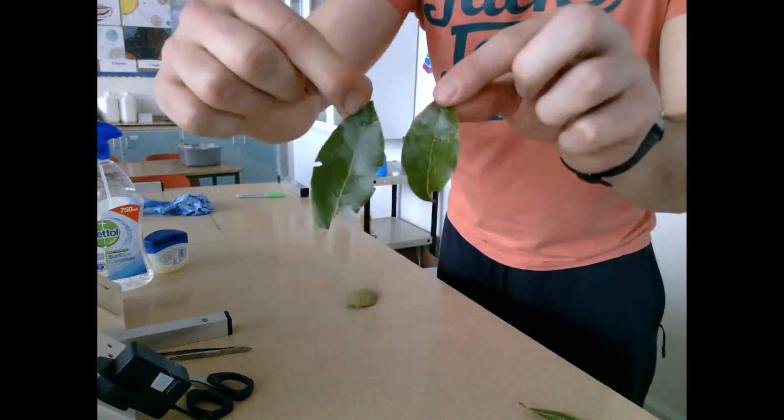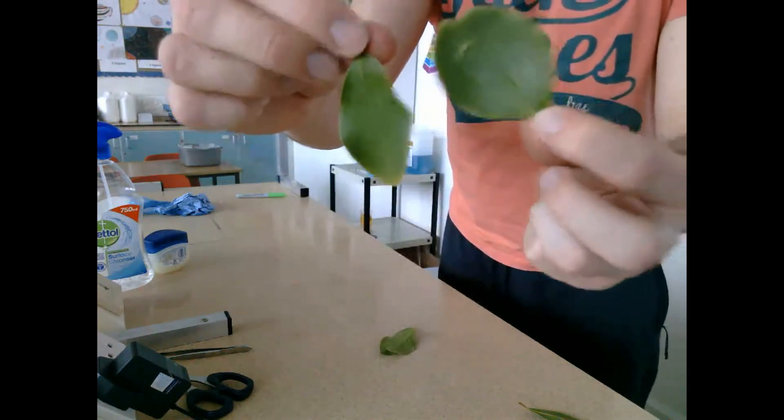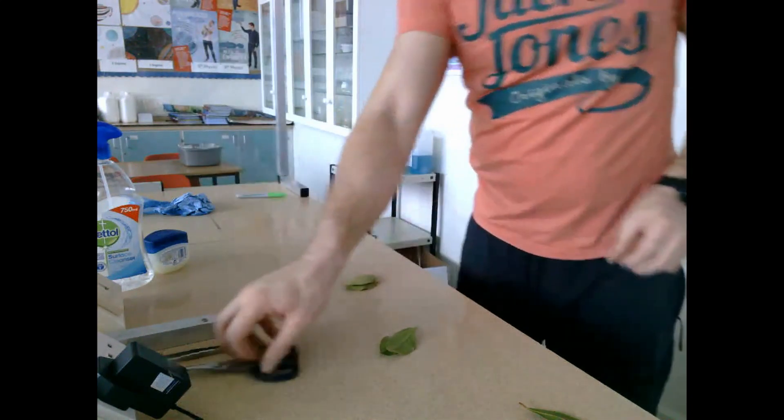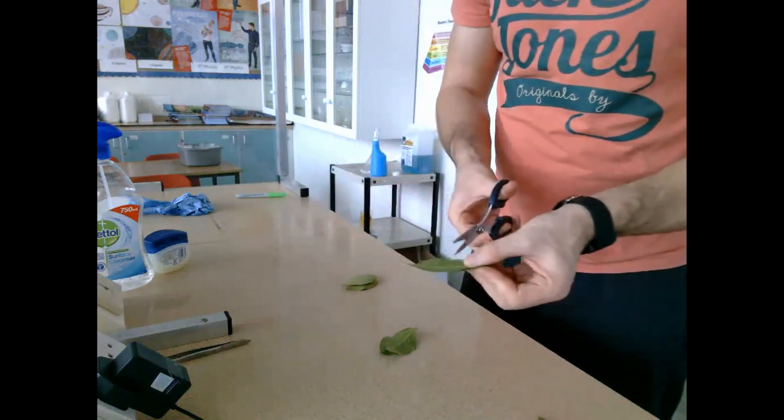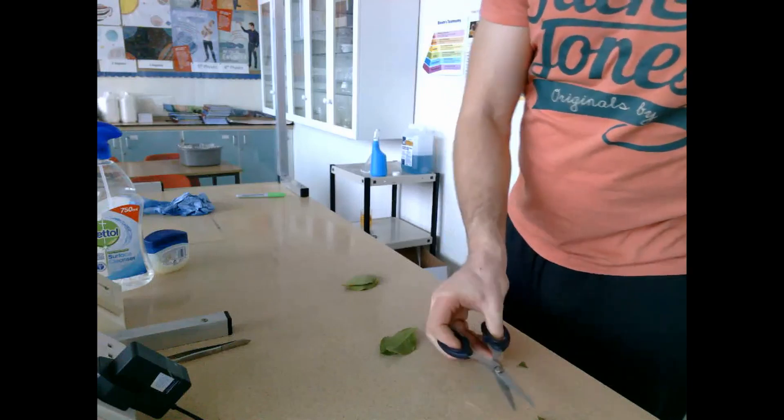What I did was pick three different types of leaves, because this was done at a time of year where leaf yeast wouldn't be that prevalent — it was done in early January. Preferably this is done in May or September, where leaf yeast is plentiful.